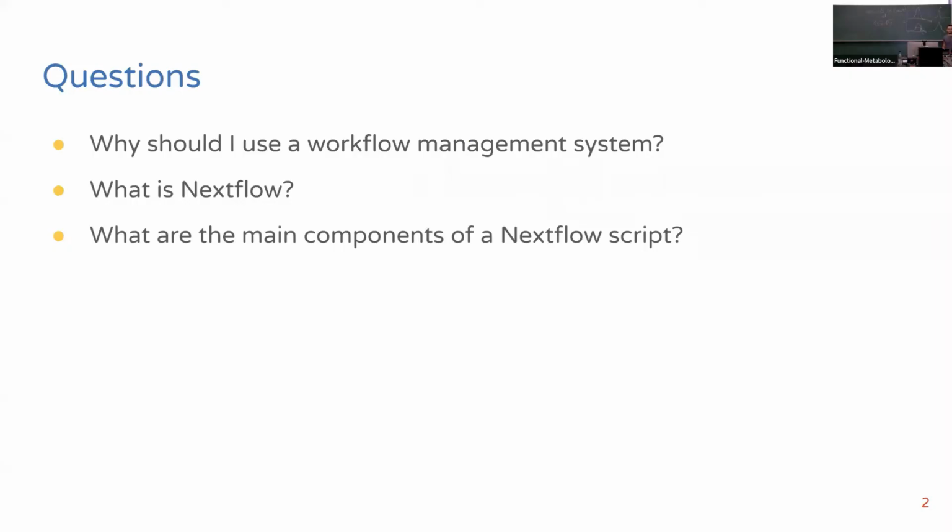So the questions are: why should I use such a workflow management system, and what kind of advantages does it give? And then we will take a look at one specific system, which is Nextflow, and Carolina and I have been getting into it during the last weeks. I think it's a very nice example and very useful. So we will give an introduction and also check out the main components of such a Nextflow script.